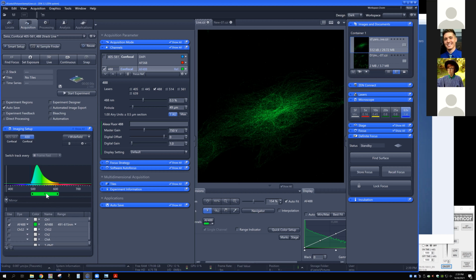And I can either do that by working with this element here on its own, or I can do this by typing in to these values here. So if you like round numbers, you can basically type in the values exactly as you would like them to be. So pretty flexible in terms of being able to set all of these things up.